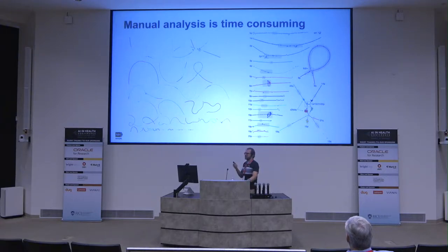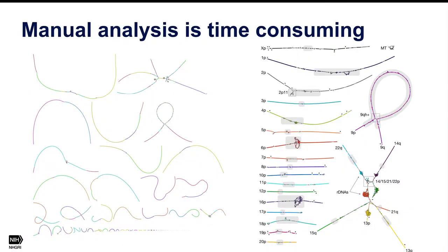So they end up with just no data there. And so that means we have to recognize that this is a piece of the same chromosome as this and put them together. This happens a lot in some chromosomes, like at the beginning of chromosome X, but it does happen one or two times on average for the chromosomes of the human genome.